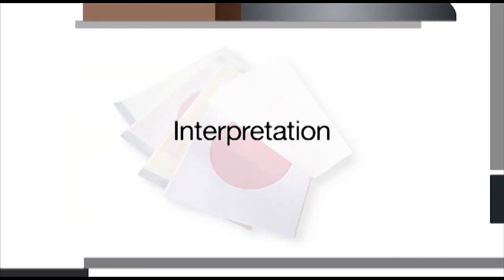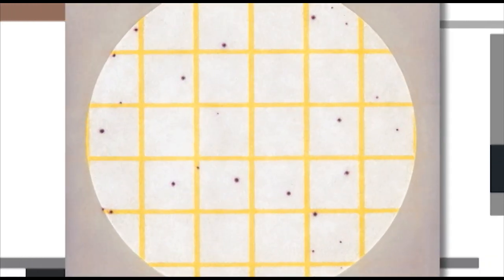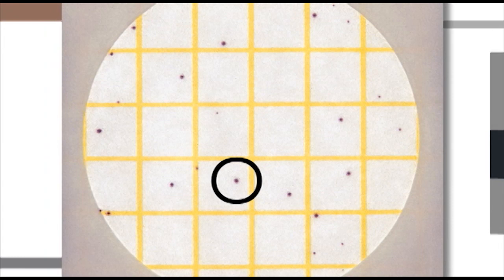The next step in microbial testing is interpretation. The indicators in the 3M Staff Express Count Plate cause Staph aureus to appear as distinctive red-violet colonies. If red-violet colonies are present after the 24 plus or minus 2 hours incubation, count the colonies as Staph aureus and the test is complete. The disc is not needed.